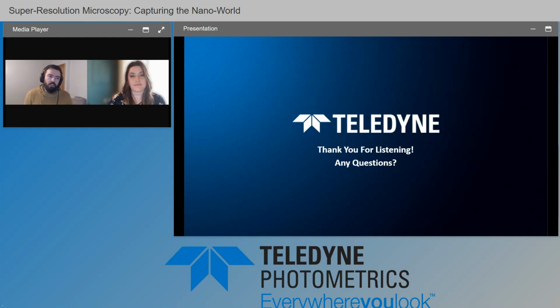So the advantage is that you get to see smaller samples, essentially. The reason you have super resolution is because with normal microscopy, you can't see below roughly 200 nanometers, thanks to the diffraction limit of light. So the advantage is you get to see samples below that level. And as you can imagine, for things like looking at viruses and determining viral structures during the coronavirus pandemic, it was very important to have systems that are able to image viruses and see what kind of structure they have, what the spike proteins are, what kind of structure the envelope has. You couldn't do that without super resolution. So that's the major advantage.